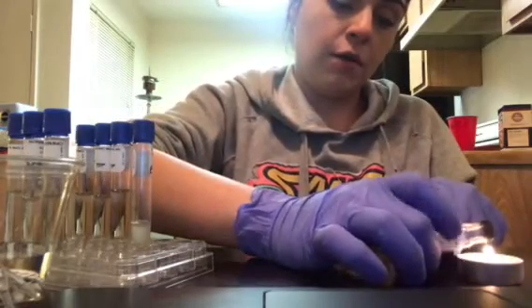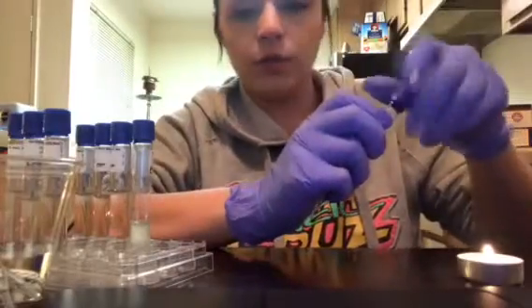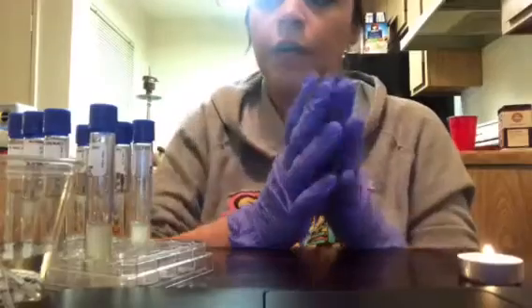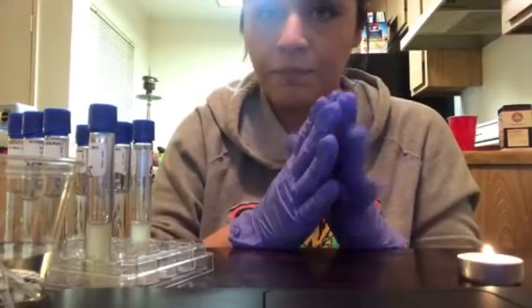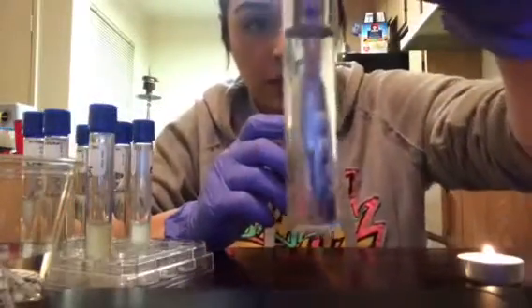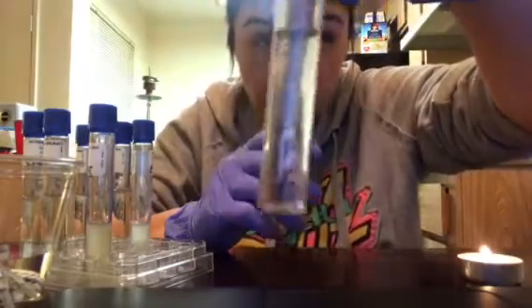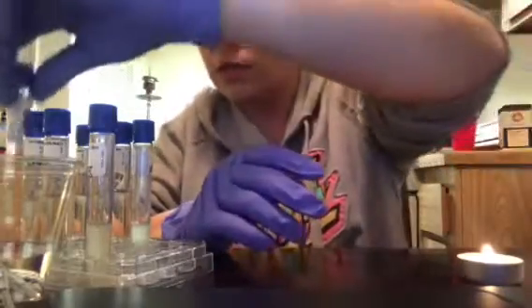Okay, so they're all sterilized, and now what I'm going to do is incubate them for 48 hours. After that, I should have a different look to them. Right now they're pretty clear, as you can tell. There's no, is it turbidity? There's none that I can see for any of them.